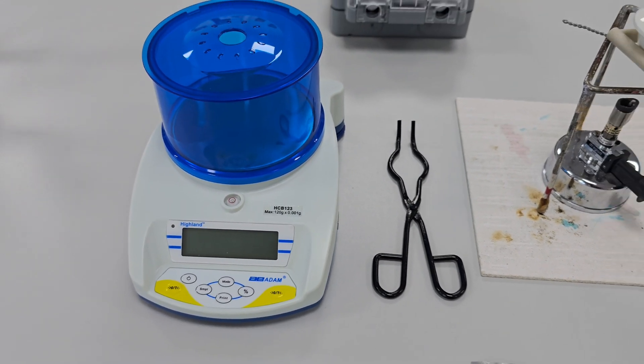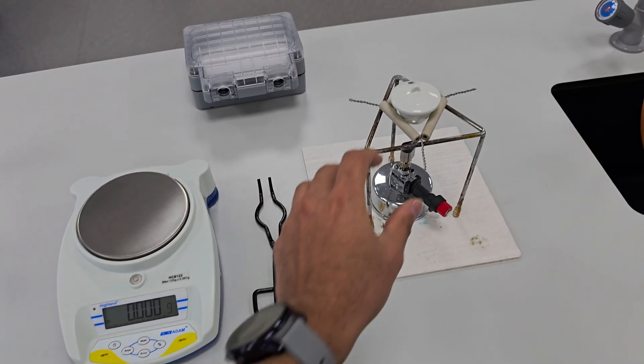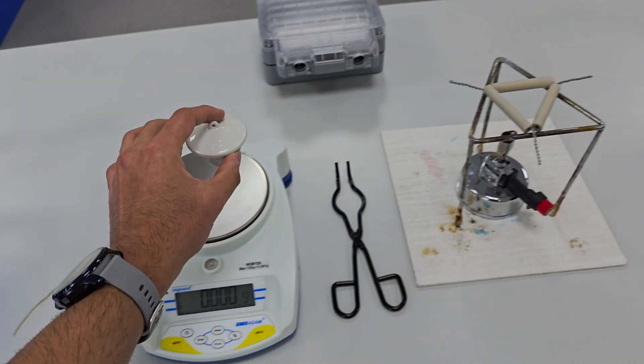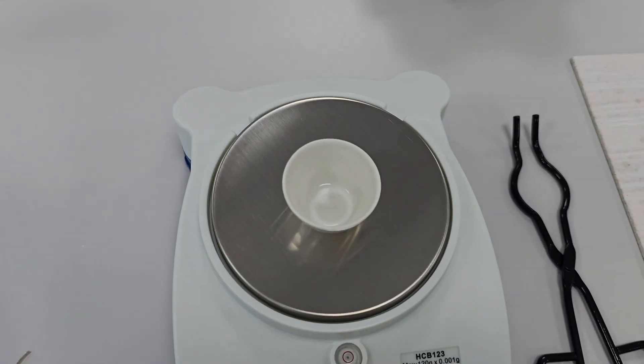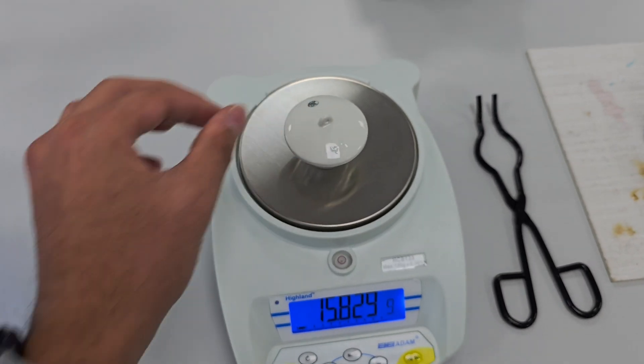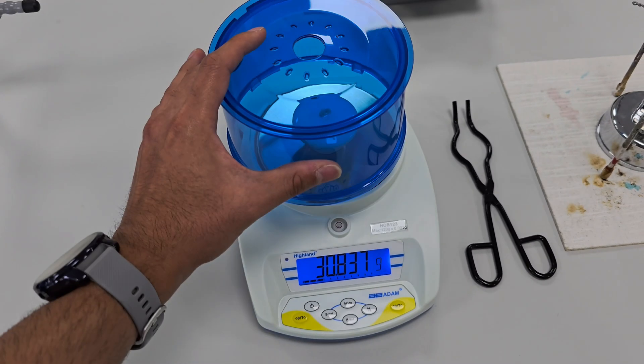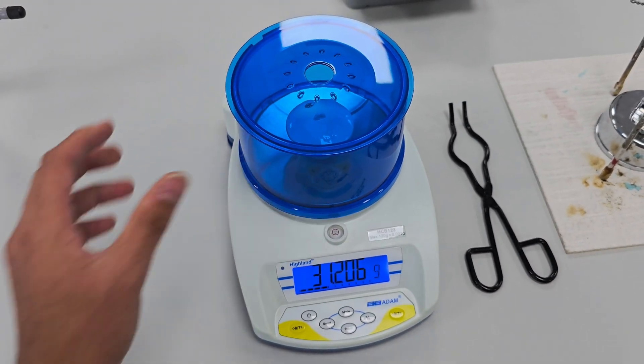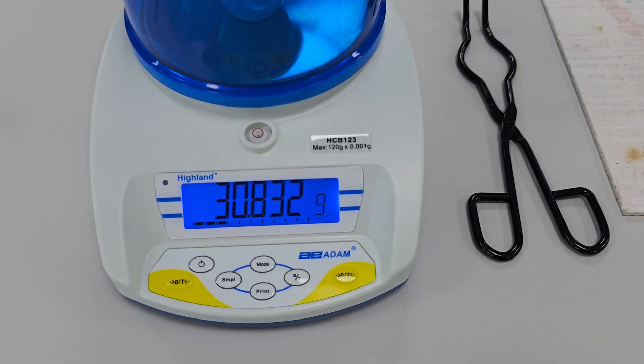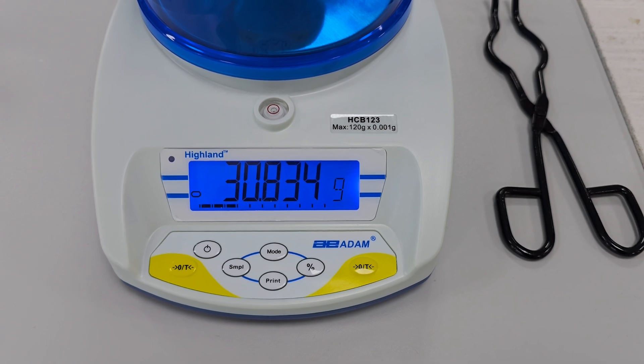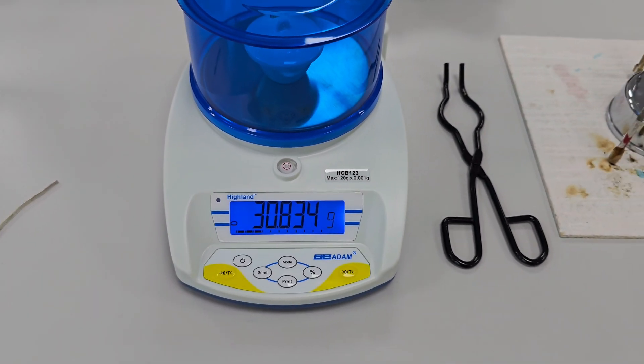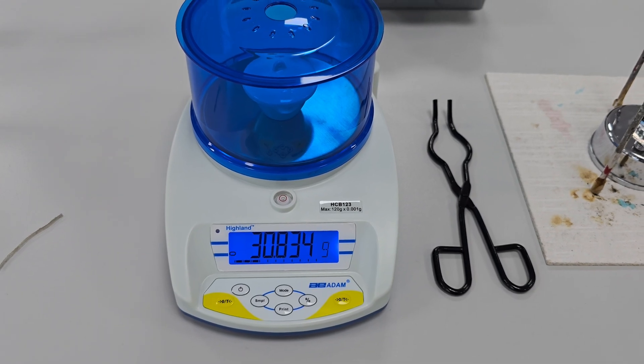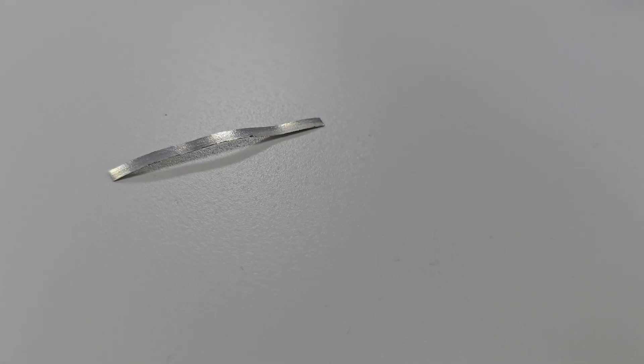Let's get started by measuring the mass of the empty crucible and lid. As you can see it weighs exactly 30.834 grams. This is important because we'll need to subtract this from the final mass to figure out how much magnesium oxide we have at the end and how much oxygen reacted with the magnesium.